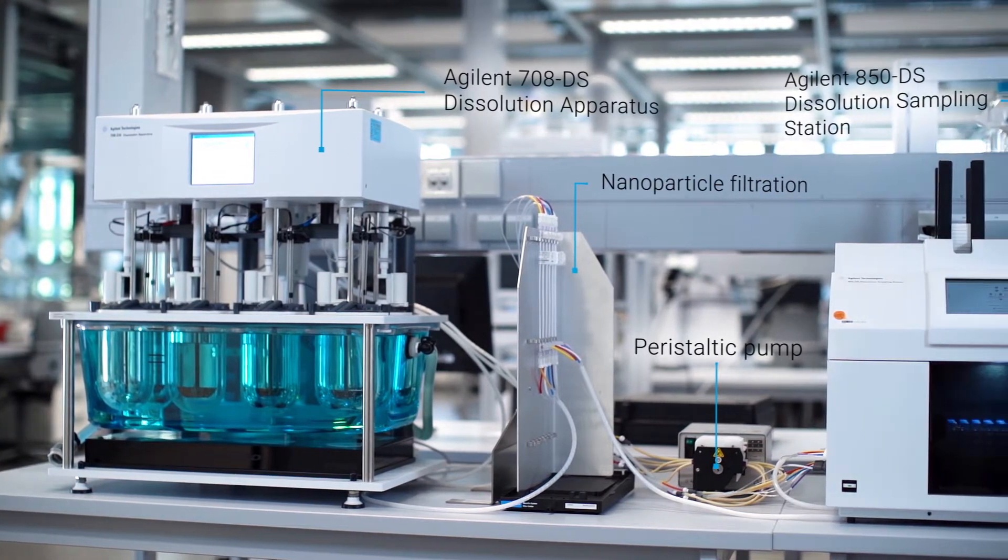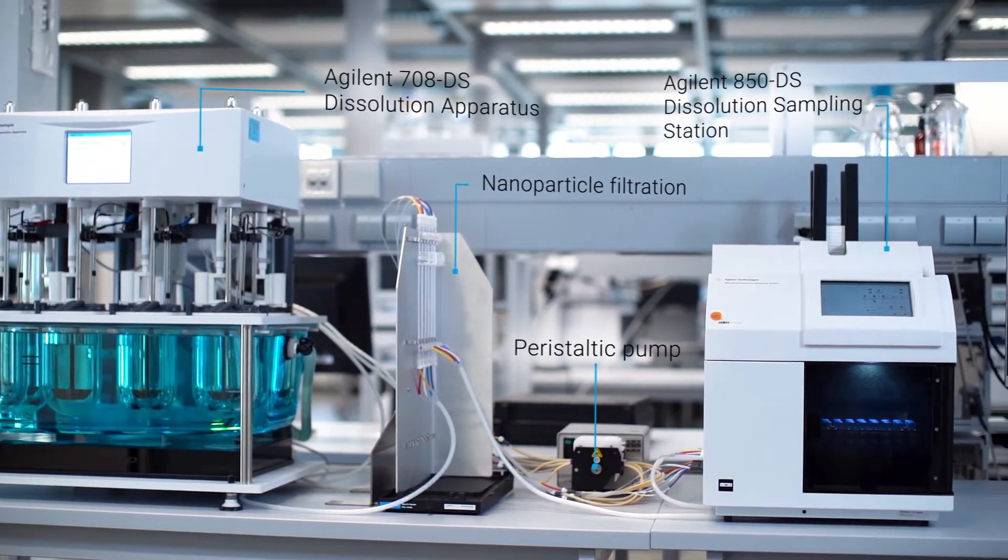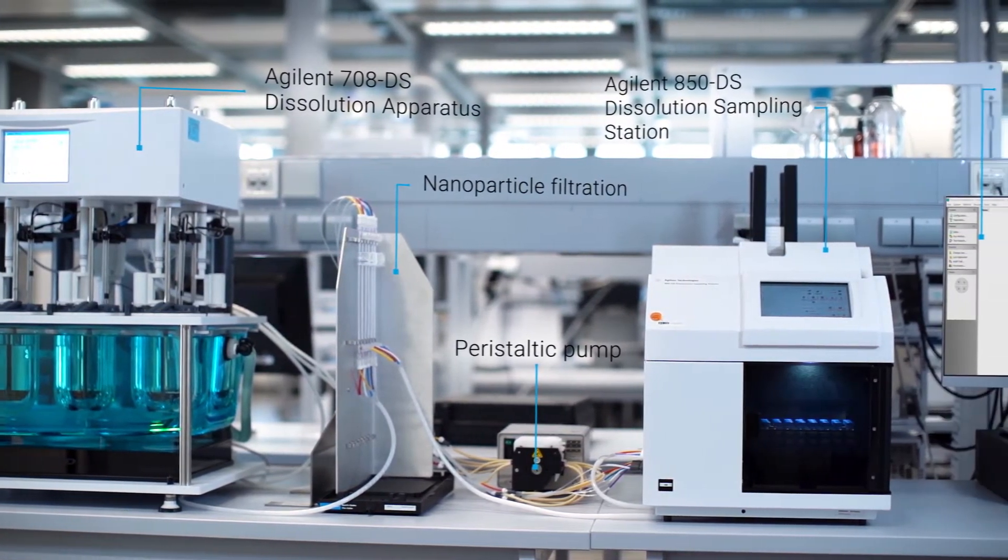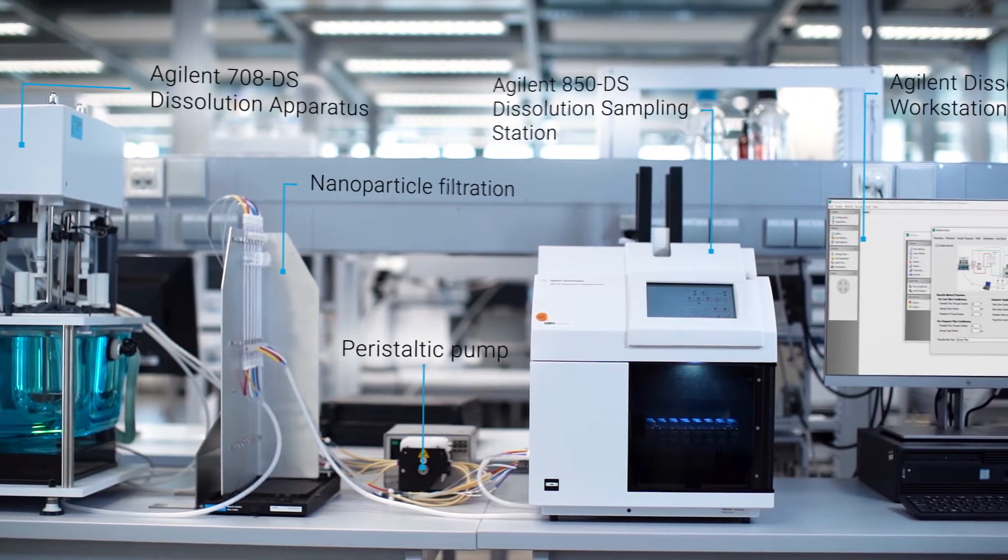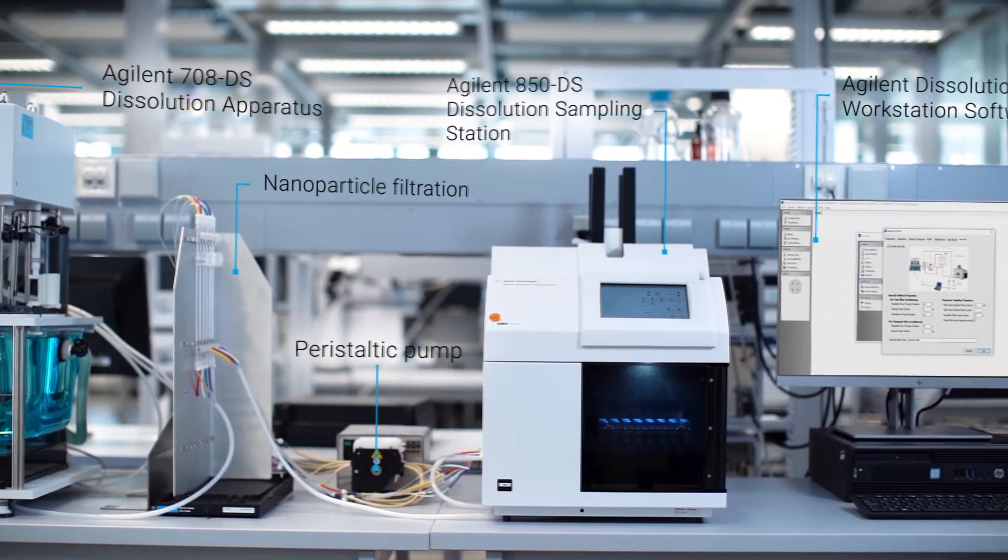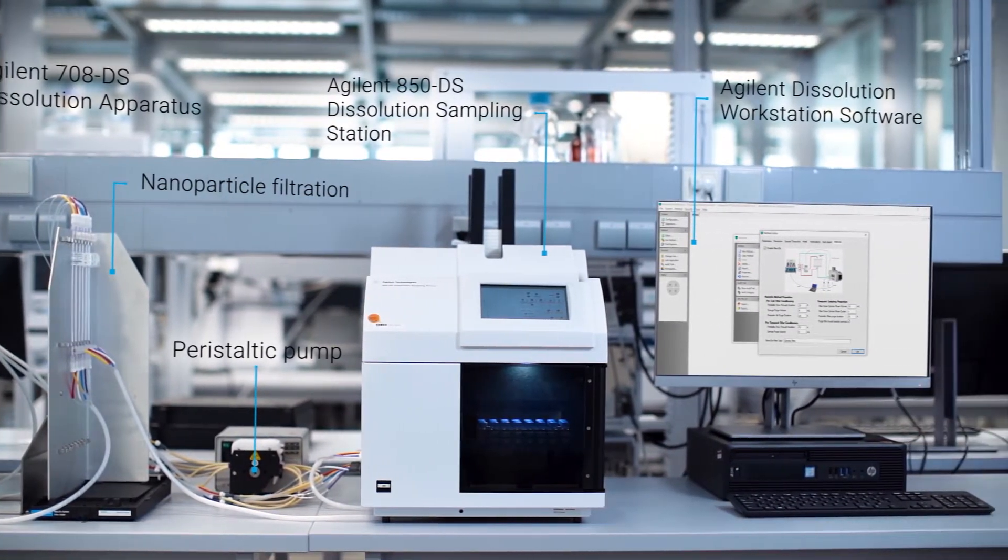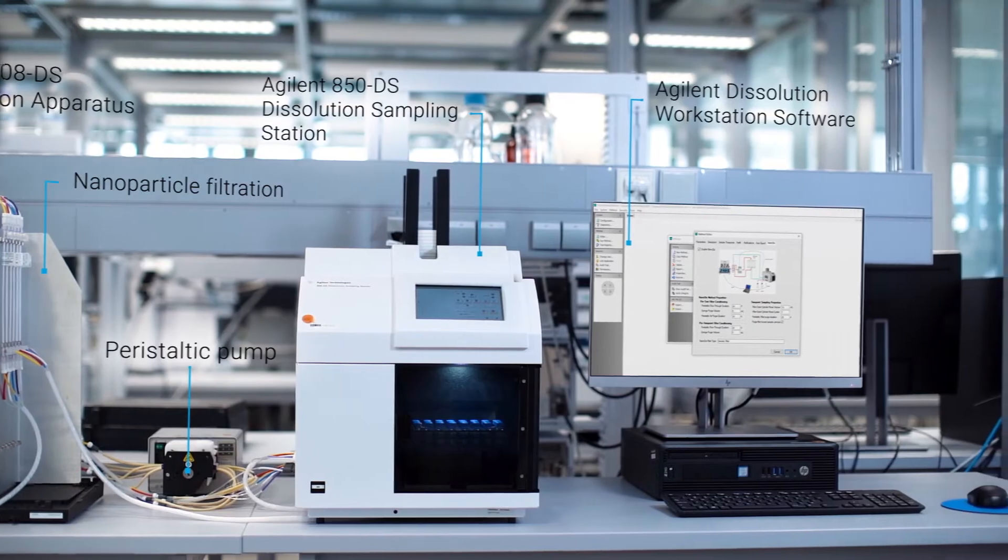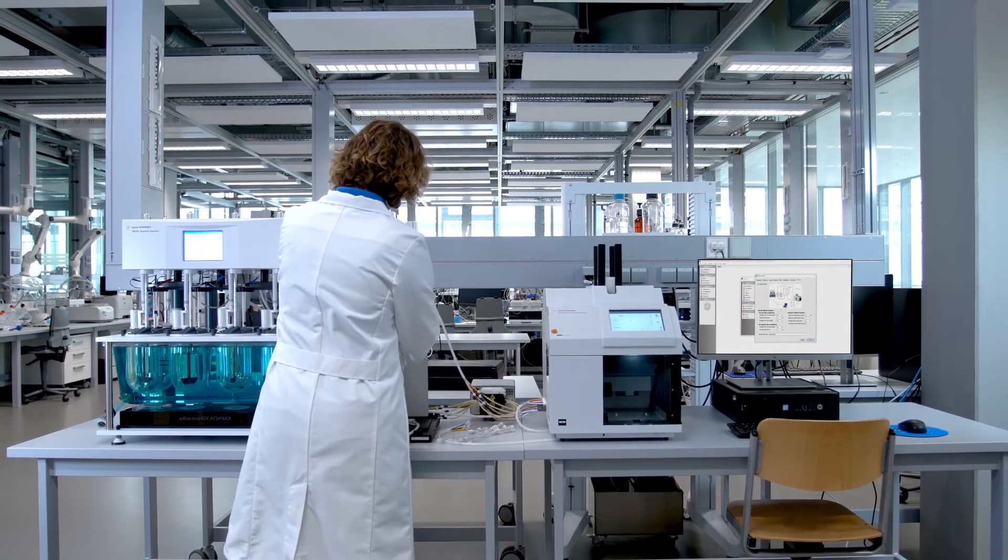The NanoDisc system combines standard USP apparatus and efficient filtration with compliant software into a single solution to automate sampling and filtration from start to finish.